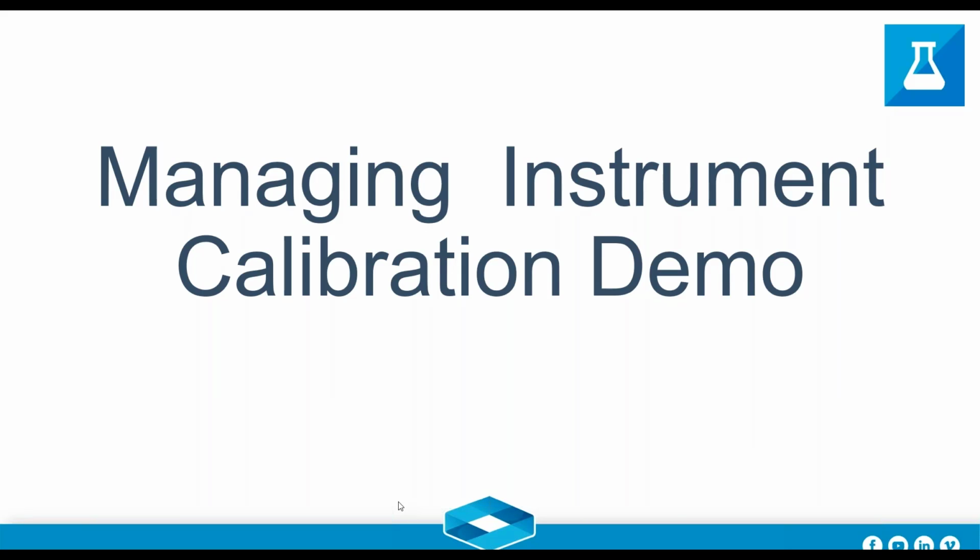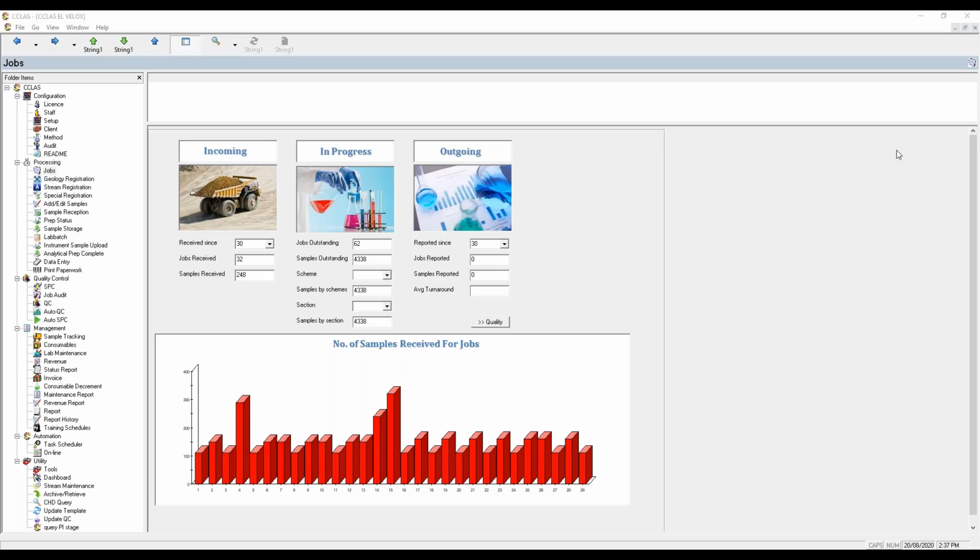So I'll just kick up CCLAS, and I'll just have to shift my screen, which is always interesting. So hopefully you guys can all now see a CCLAS Velox screen. This screen may not be familiar to everybody in terms of its appearance, but basically it's built on the CCLAS EL core. What we see here is an embellished version of CCLAS.